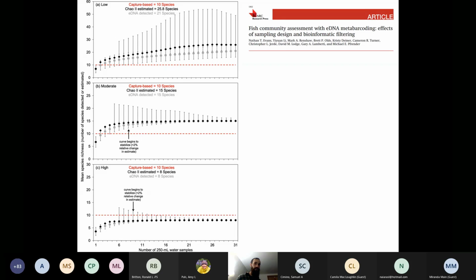And we have 3 different levels of essentially stringency in doing this interpretation step. So on the bottom we have a high level of stringency. We're removing sequences that are even relatively reproducible and abundant. On the top we have low stringency. We're including a lot of sequences, even if they're not real abundant or highly reproducible. And in the process, we're coming up with a really different mean total number of species detected.